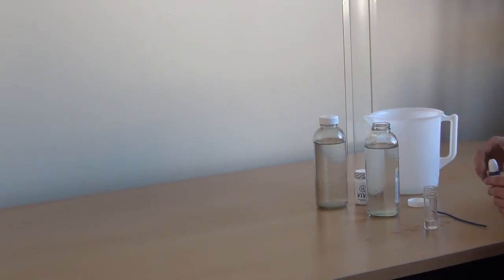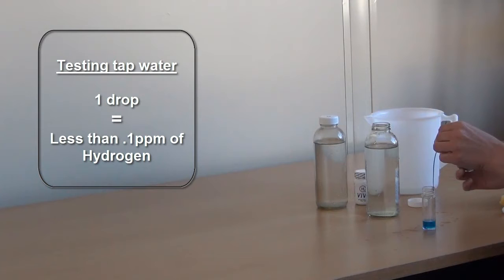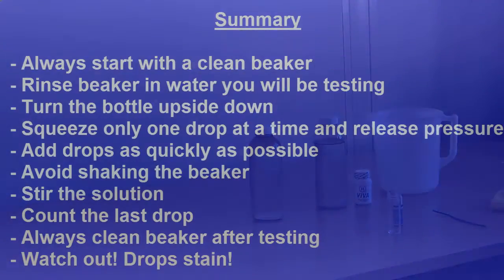Six milliliters. We'll now start adding the drops. As you can see, this time with one drop the water remains blue, meaning there is less than point one parts per million of hydrogen in the tap water.